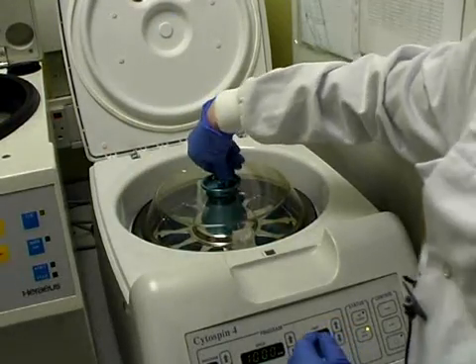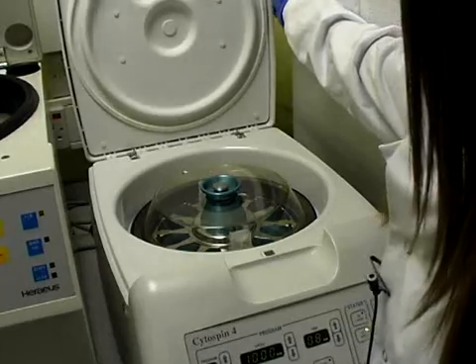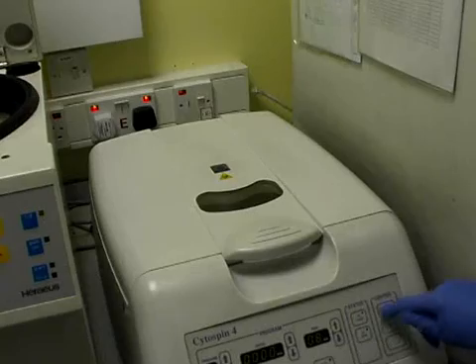We then have to make sure we put the lid on. It spins at 1000 RPM and goes on for eight minutes. I'm going to press start.